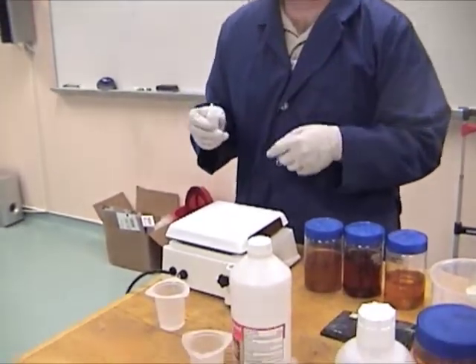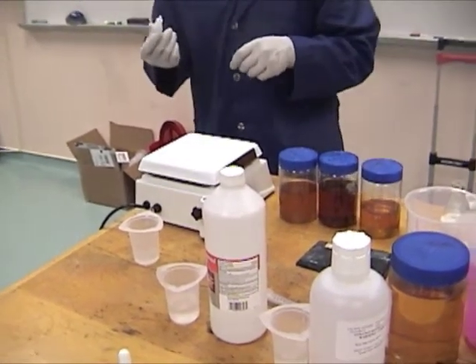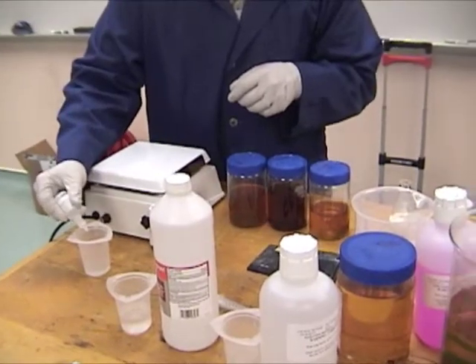Well, you've read where people say phenol red's not a good indicator. Oh, it works great. That's what I used to use when I first did it. So 2 or 3 drops in here.